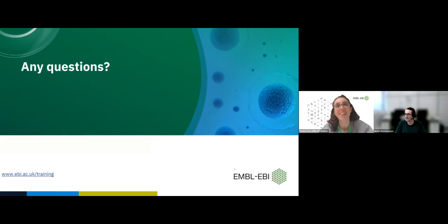Thank you. The next one received quite a lot of votes and is about Vitessce. So, is it safe to upload unpublished data there? Are they stored on a secure server, or can I use the software locally?